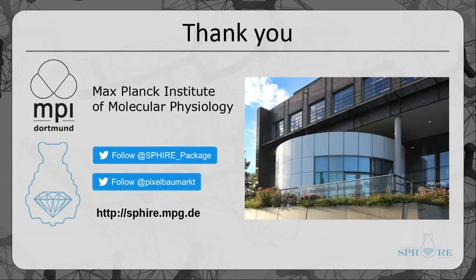Sure. So we have one more question here, just based on the approach to picking from these micrographs. They're very noisy. Pranav Shah here at HMS is asking, are you thinking to implement a neural network-based denoising tool in crYOLO? Yes. Yeah, we are thinking about that.